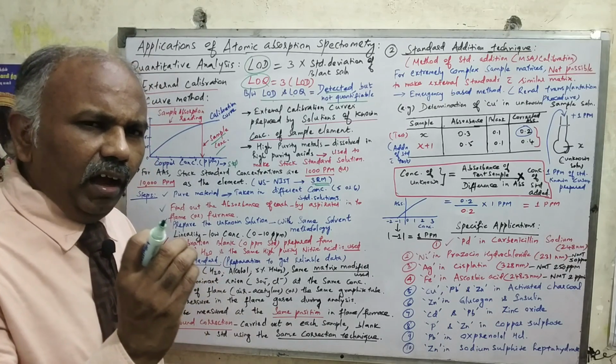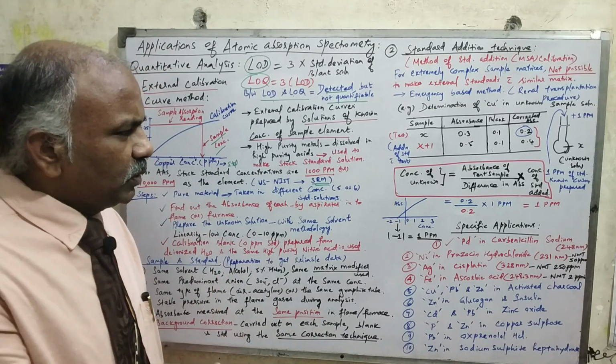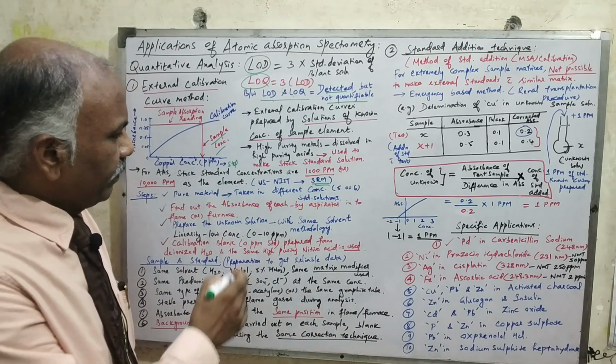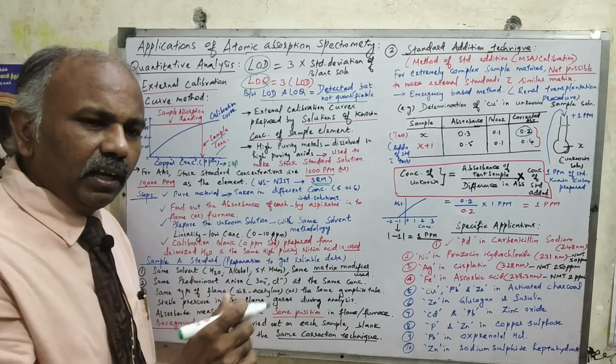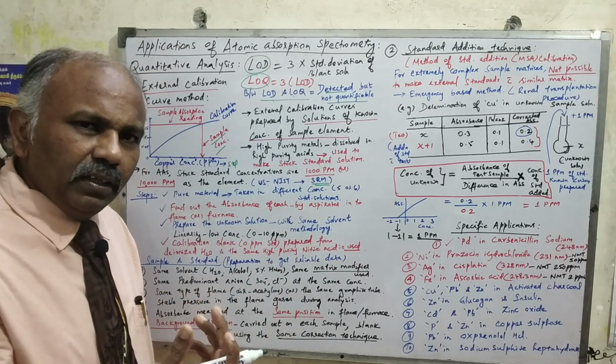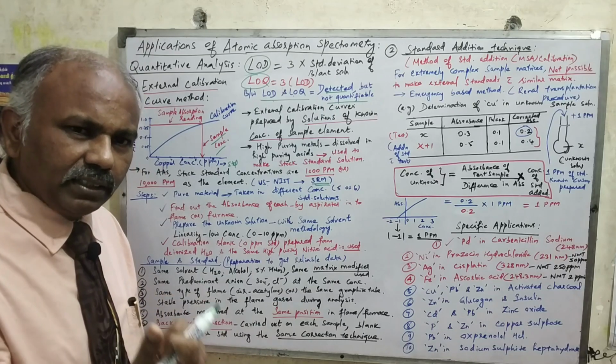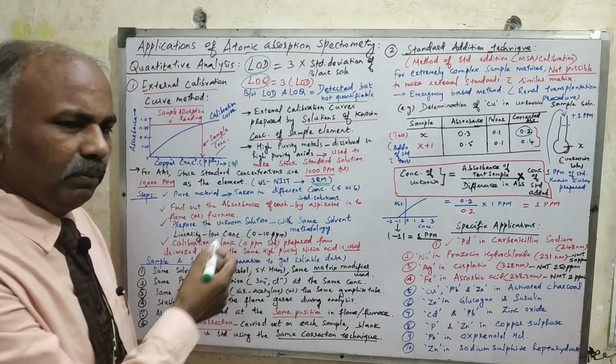They have the highest purity level, right? So if you are using standard reference materials, you will get accurate analysis, right? So we are using them for most of the elements. Instead of preparing the stock solutions every time, we directly procure the standard stock solutions available with SRM, so that we can perform the analysis, right?